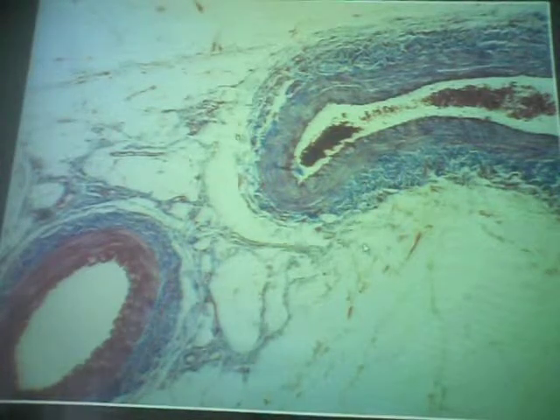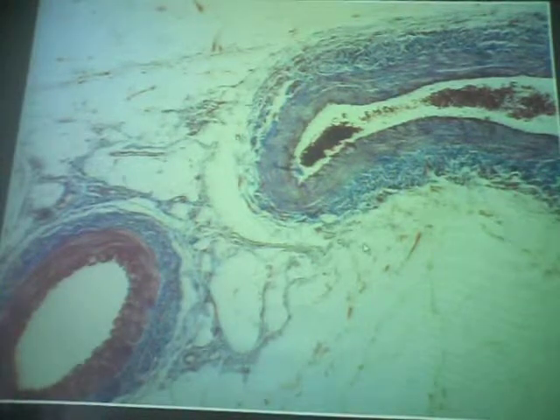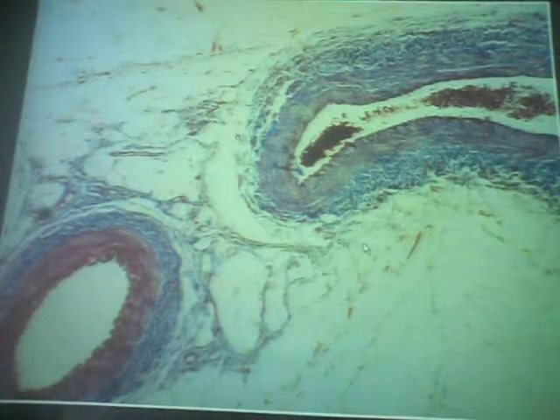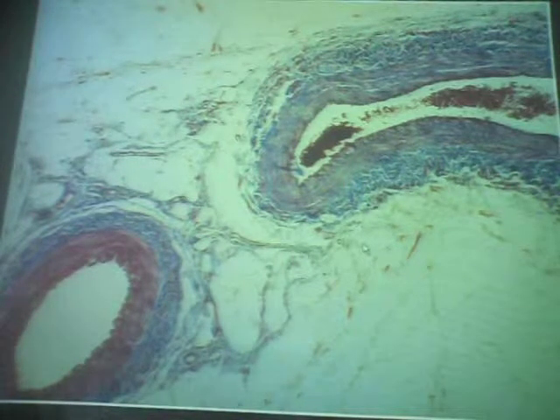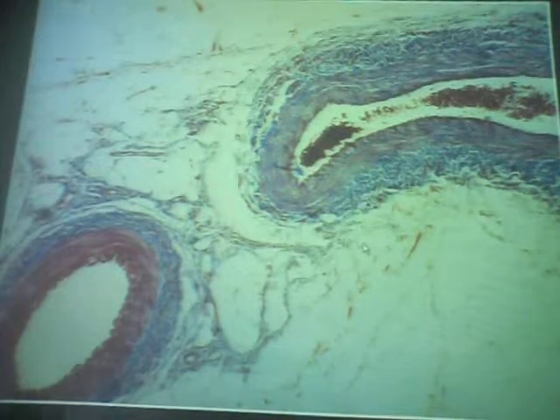And the other slides will be on the trachea, the wall of the trachea, and sections through the lung. And not that much, but there are a few pertinent features that you need to be able to identify. So don't just blow it off, say, well, I'm just going to throw those points away. Those points may come in handy later on.